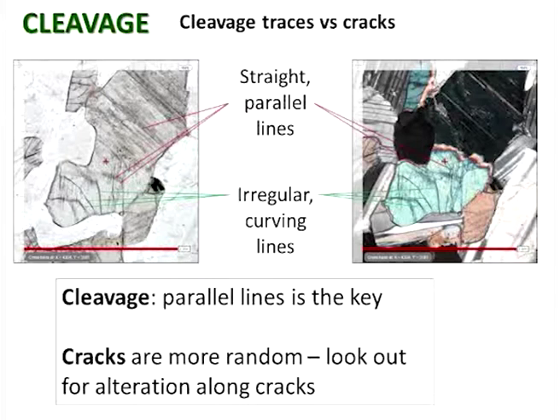It's the same in thin section. Thin section minerals often have cracks. Here we've got one that has slightly fewer cracks, but it still has some cracks. In plain polarized light here, you can see those quite clearly. And cracks often stand out much better than cleavage, unfortunately, so they tend to draw the eye. They stand out in the same way that grain boundaries do, with a similar boldness, if you like.